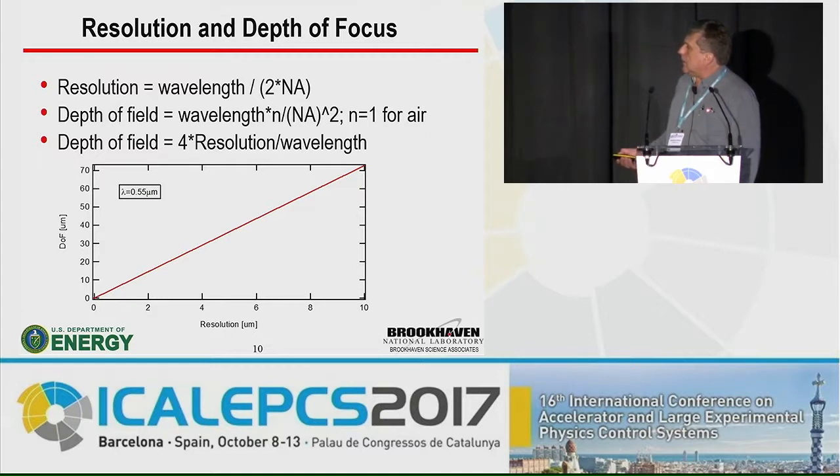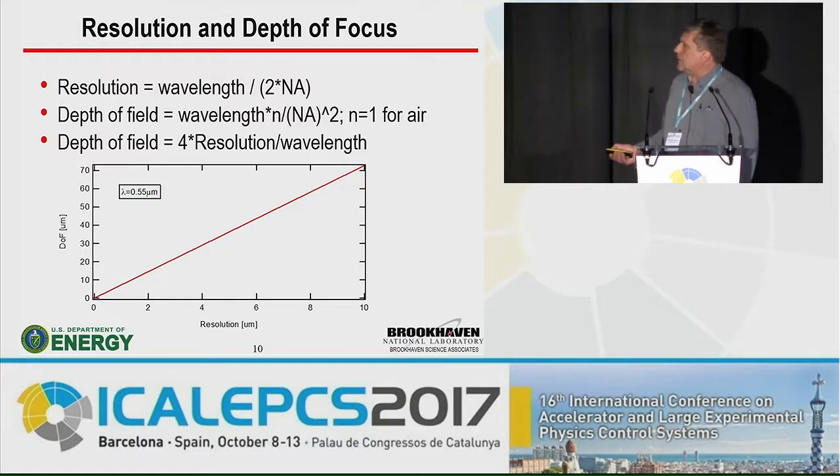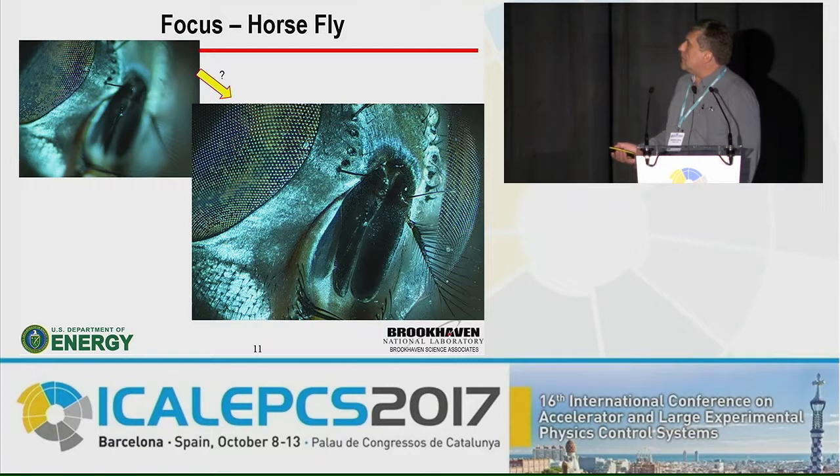On 10ID, we're working around 3 microns, so our depth of focus is around 20 microns. So if we have taller objects, we only see part of the object in focus. As we move to 1 micron, we've got an even bigger problem, because the depth of focus is well below 10 microns, somewhere around 5 or 2 microns, depending on whether the optics is telecentric or not. So how do we get from an image that is focused in one spot to an image that is focused globally?